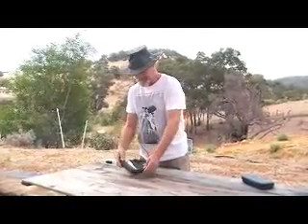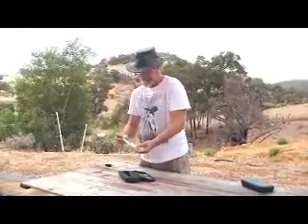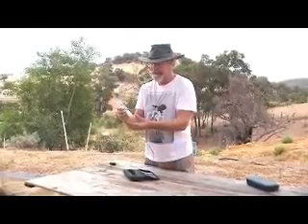Hi there, my name's Graham from Fantastic Farms. Today I'd like to talk about a product we've been selling for a few years. It's our waterproof salt meter, or salinity tester, electronic version.